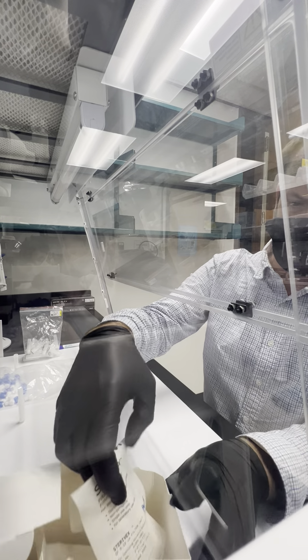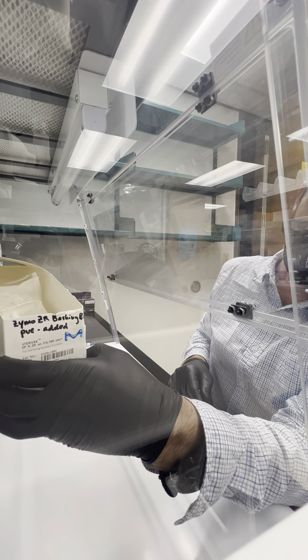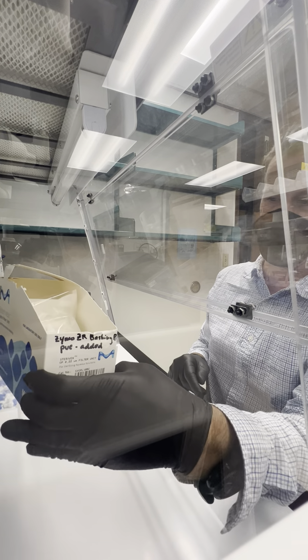We've got a box that's labeled indicating that the Zymo ZR bashing beads have been pre-added. That's all there is to it.